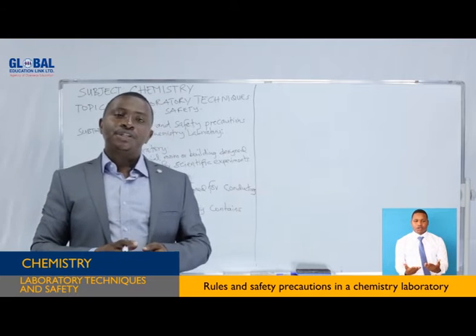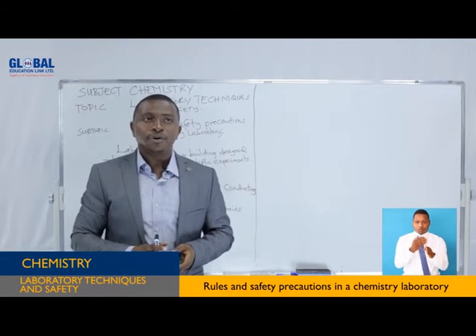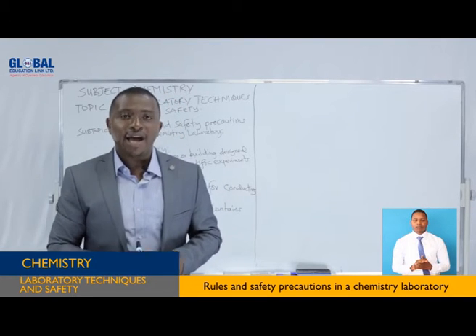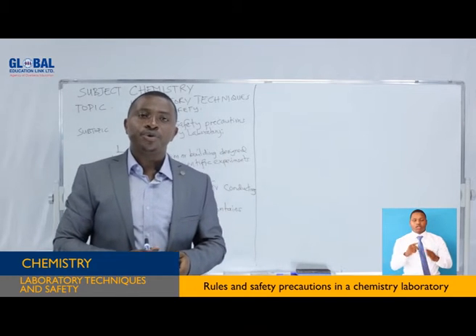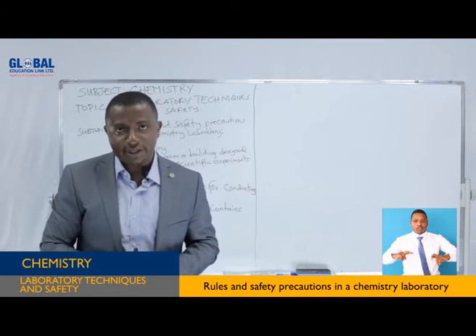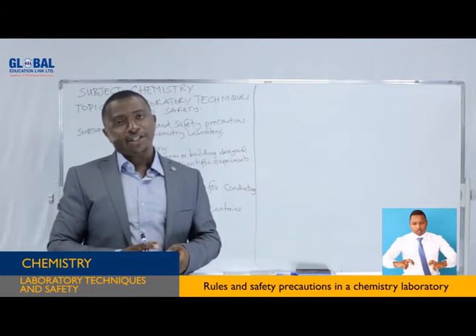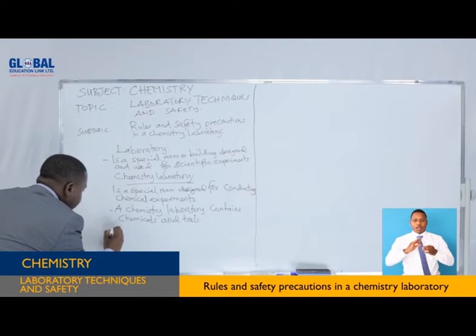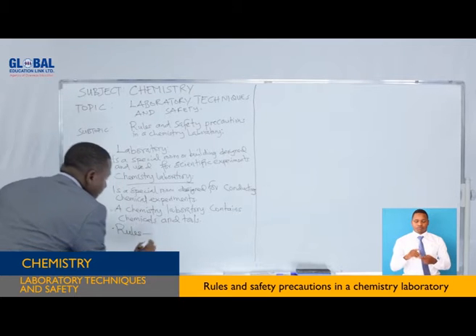Now we shall concentrate on rules before doing practical activities, and thereafter we shall see rules when doing practical activities and the rules after doing practical activities. So there are three categories of rules.